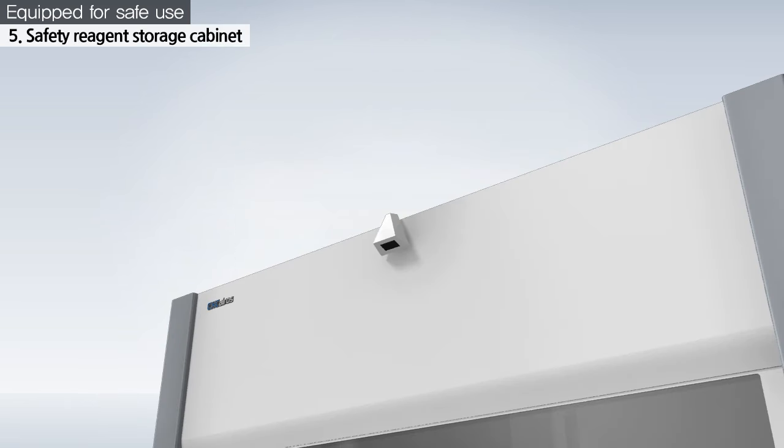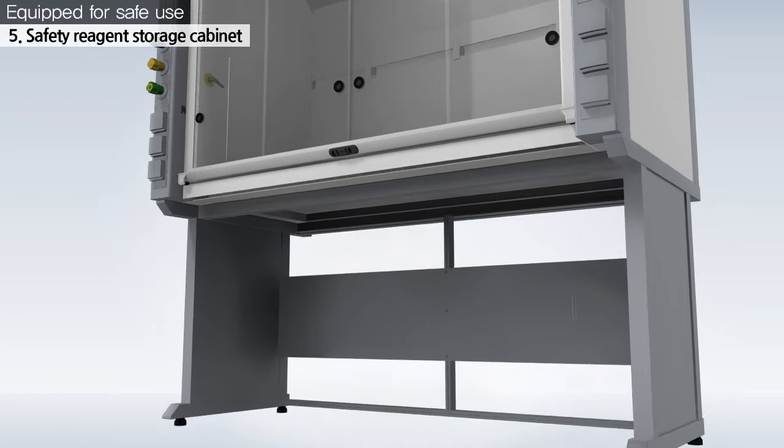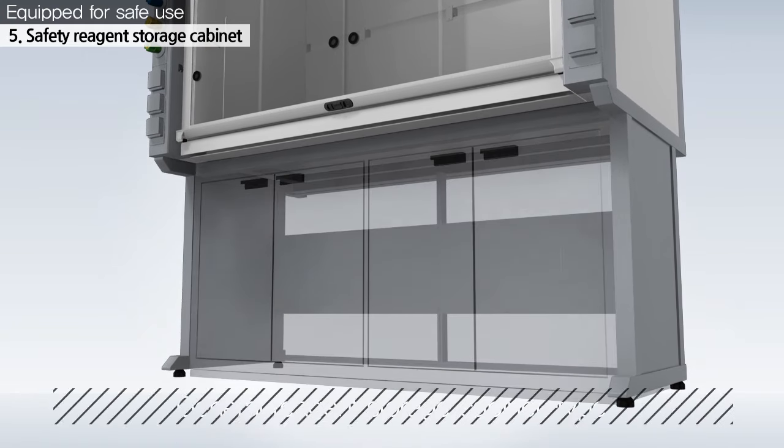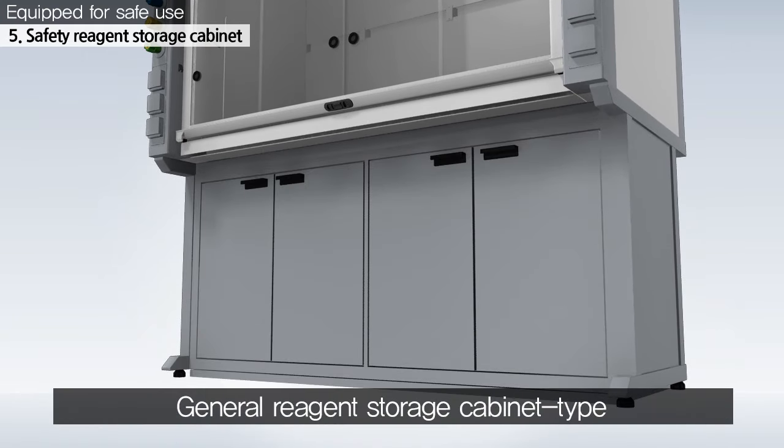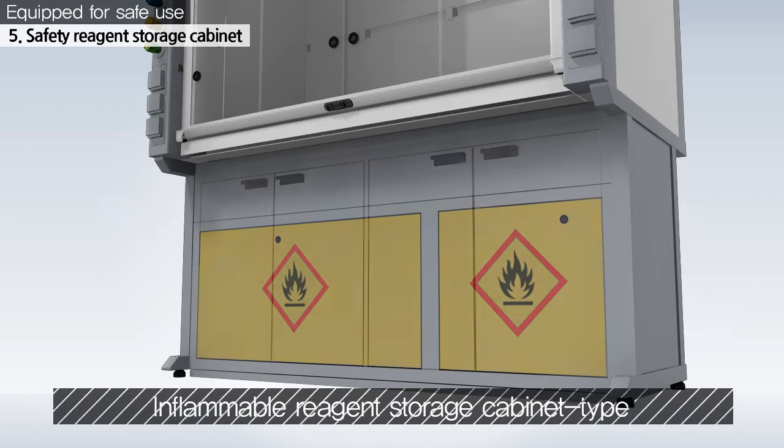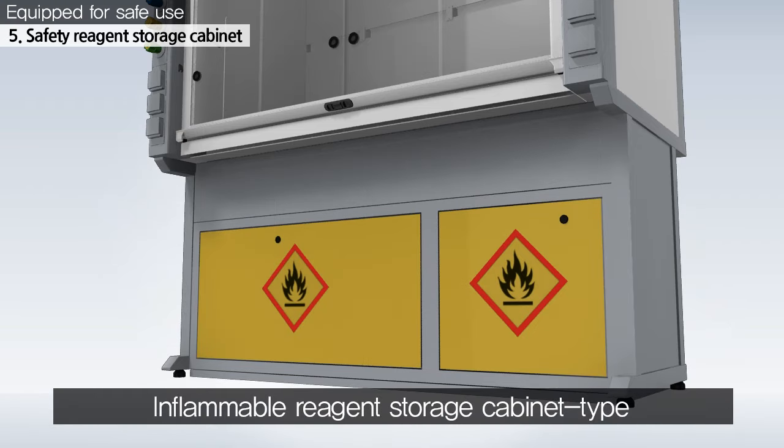The CHC Lab is designed to ensure maximum leg room under the fume hood. But it allows various types of built-in reagent storage cabinets suitable for a range of lab environments.